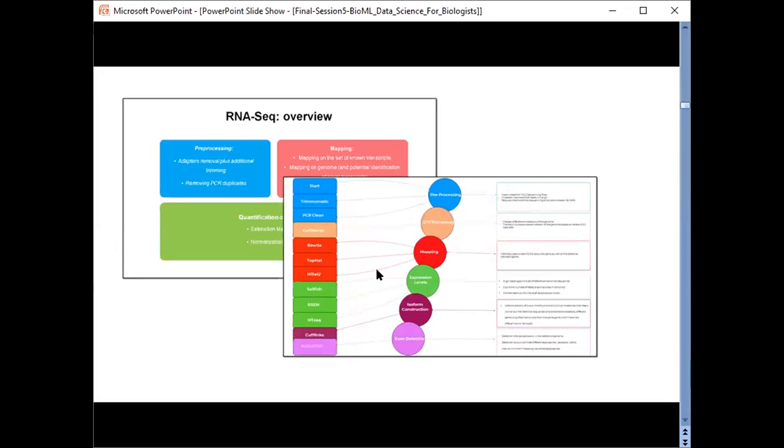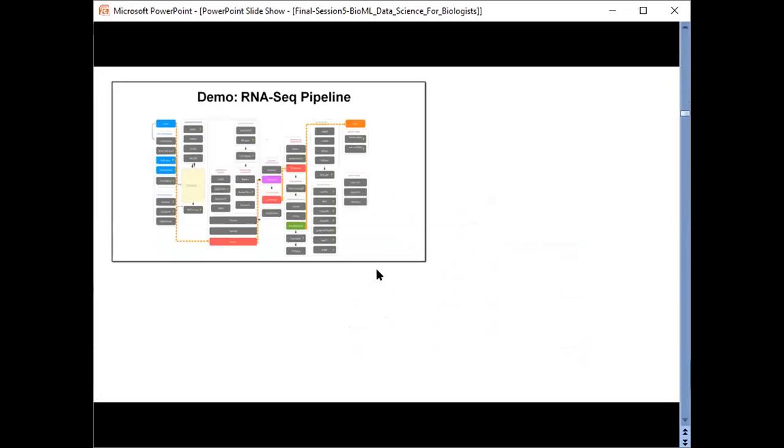We also learned about the different algorithms that are used to pre-process and process this NGS RNA-seq data. Next, we demonstrated how we can generate a well-structured gene expression data table from raw RNA-seq reads.